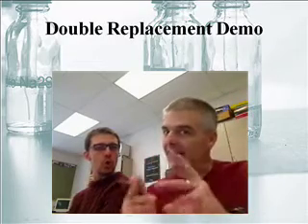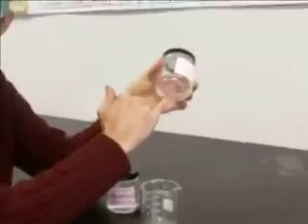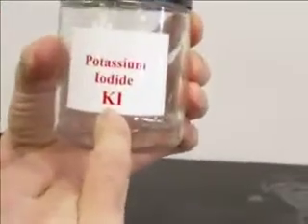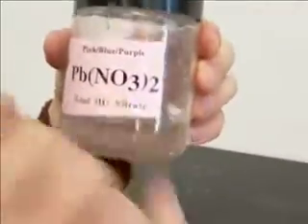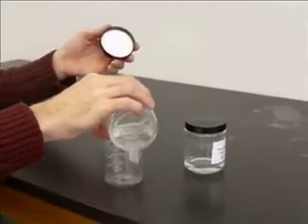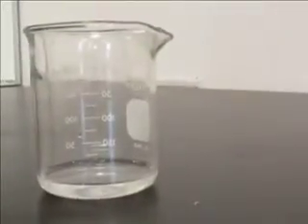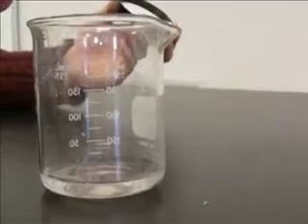All right, Mr. Sams, you ready? I'm ready. Mix some chemicals and put them together. Now we want to show you a double replacement reaction. A double replacement reaction occurs between two ionic compounds that are in solution. Here I have a solution, meaning dissolved in water, of potassium iodide, KI. It's a clear and colorless liquid. Here I have a solution of lead-2 nitrate, also clear and colorless. Two ionic compounds in solution. I'm going to add a little bit of lead nitrate to my beaker, and then some potassium iodide to my beaker.